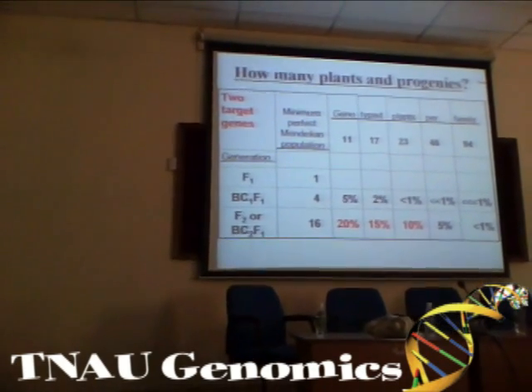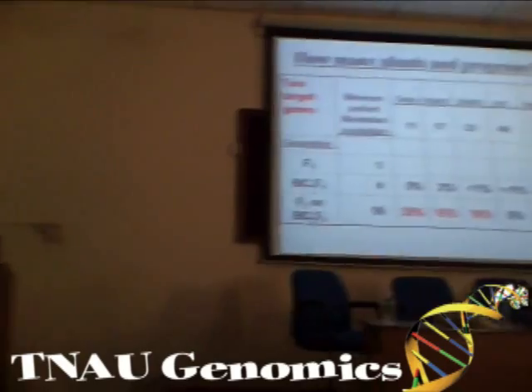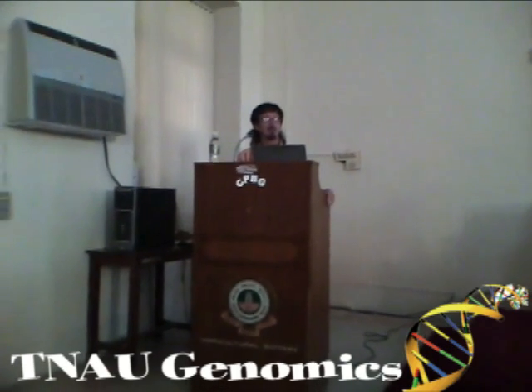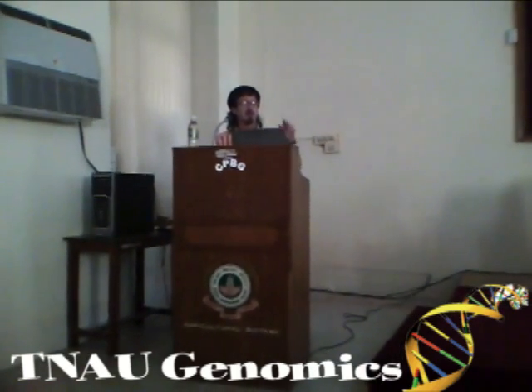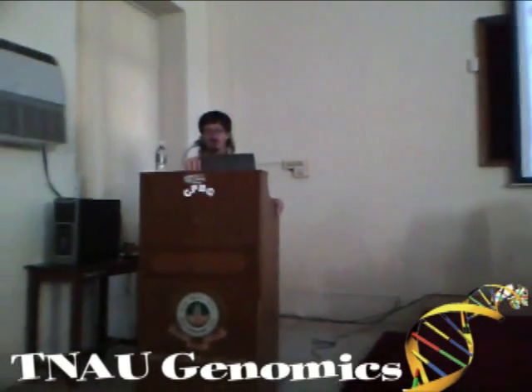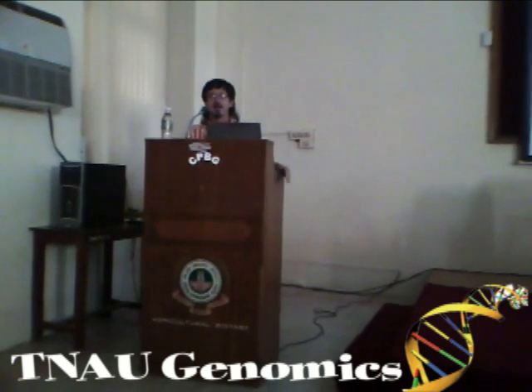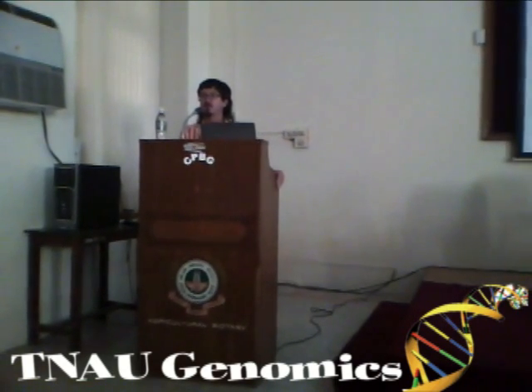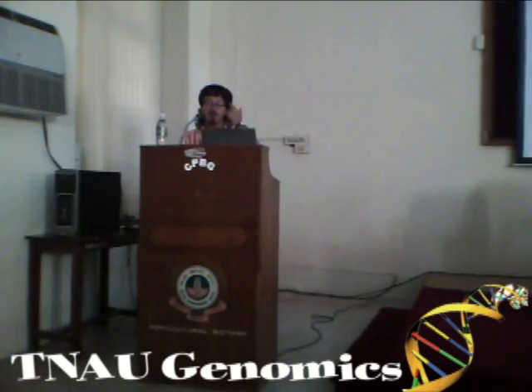In marker-assisted breeding, you do a lot of things in sets of 94. 94 because the plate that we do all of our PCR reactions in is 96 wells, and 2 of those wells should be for your parents. So you have 94 wells left for your population. You might want to leave one of those wells for a negative check. You might want to use one of those wells for a reference genotype. But in any case, you've got over 90 wells in the population.